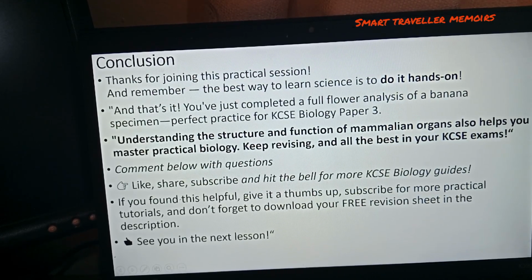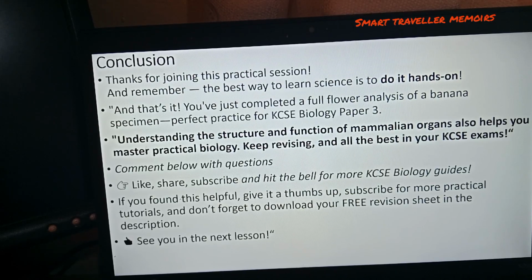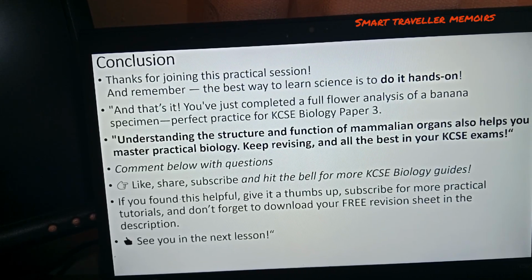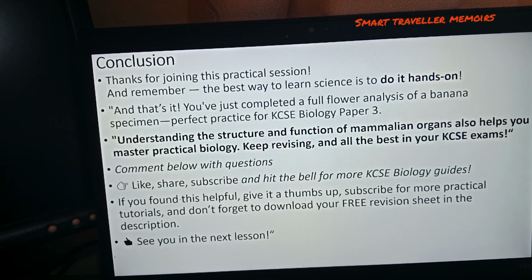I conclude by telling you this. Thank you for joining this practical session. And remember, the best way to learn science is to do it hands-on. And that's it. You have just completed a full flower analysis of a banana specimen, which is perfect practice for KCSE Biology Paper 3. Understanding the structure and function of the mammalian organs also helps you master practical biology.